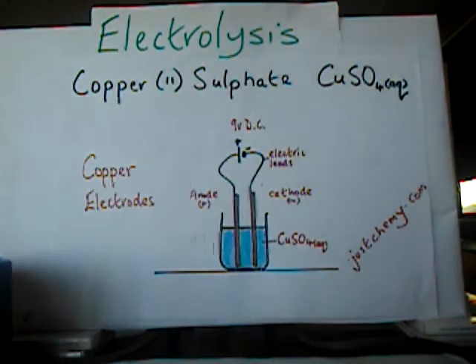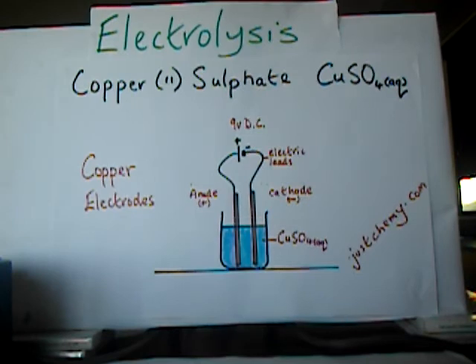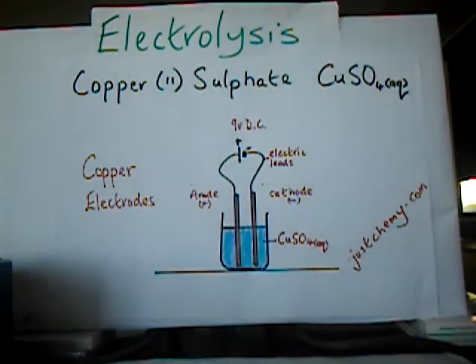Here we take a look at the electrolysis of copper sulfate solution. The solution, as you can see, is blue. This here is copper sulfate solution.